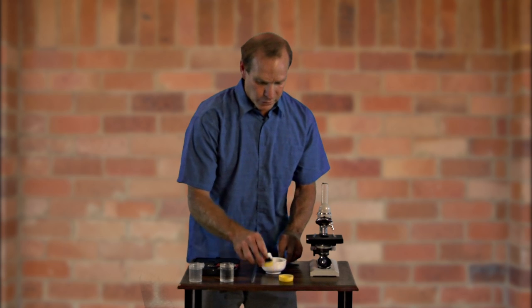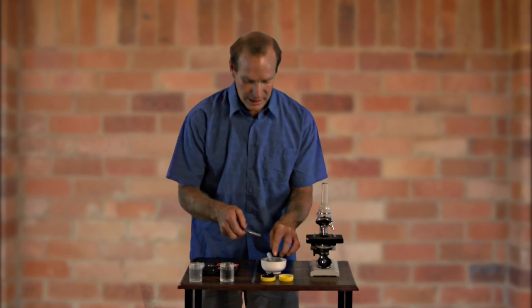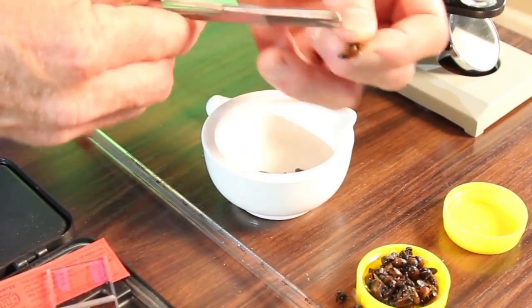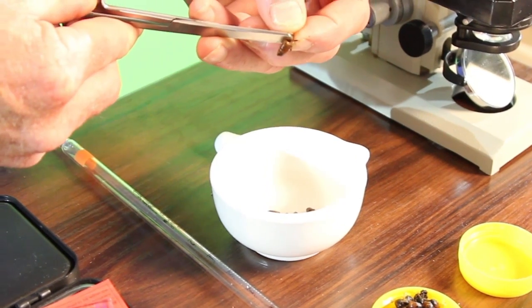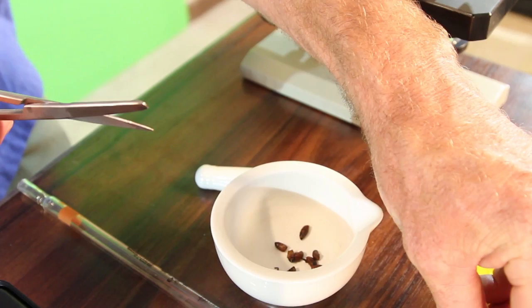For this test, we require the abdomen of 10 bees. It is a gut disease for the bees, so we only need the back end of the bee. We use scissors just to snip the abdomen off. So we remove 10 of those. So now I've got the 10 abdomens in there in the mortar and pestle.